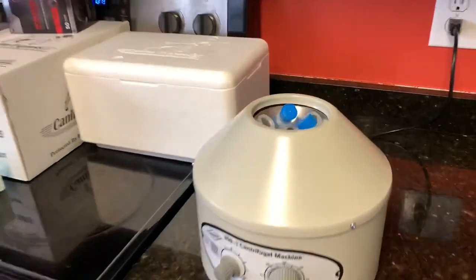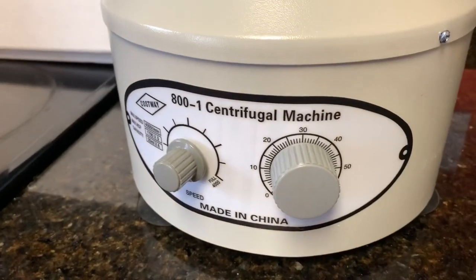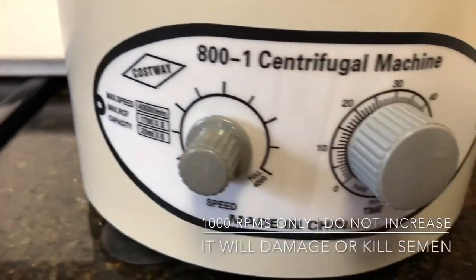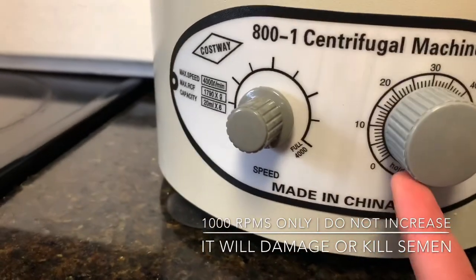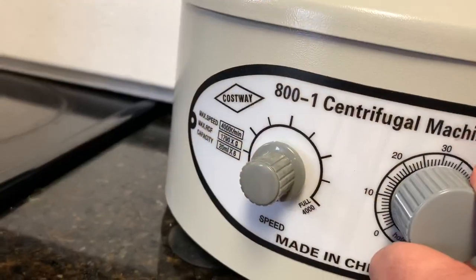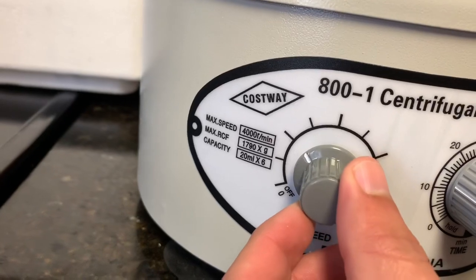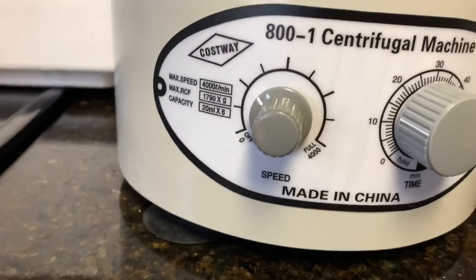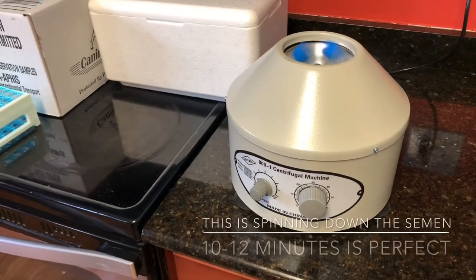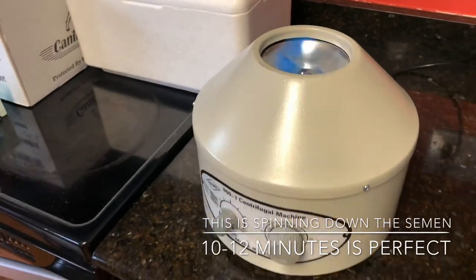All right, guys, so now that we have the semen in the tubes, this is what you call a centrifuge, and we're going to put it at 1,000 RPMs for 12 minutes. There's a timer here with a little white line down on the bottom. 12 minutes, right? And then we're gonna put it at 1,000 RPMs, and in 12 minutes this guy will beep and slow down, and then we'll show you what it looks like.